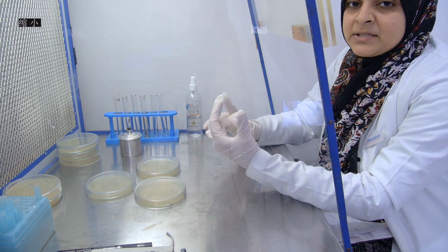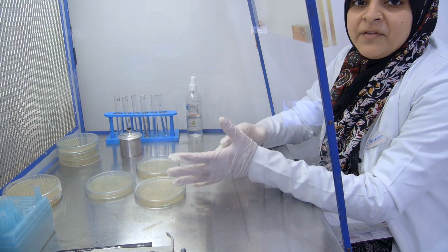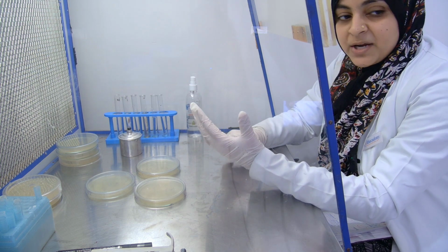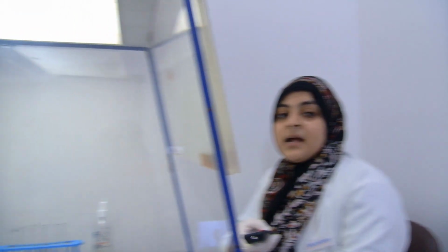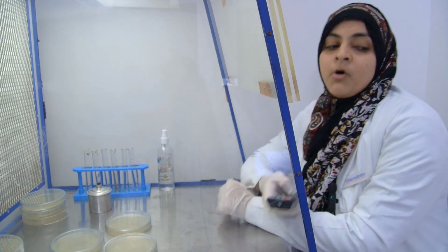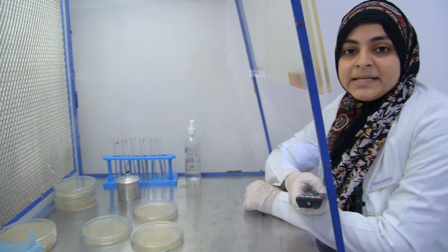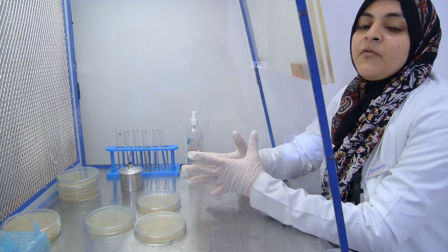We mix agar separately into 100 ml of distilled water, and in 150 ml of distilled water we mix yeast extract, sodium chloride, and peptone. Then we maintain the pH, and after that we sterilize it in an autoclave at 121 degrees Celsius and 15 psi pressure for 20 minutes.